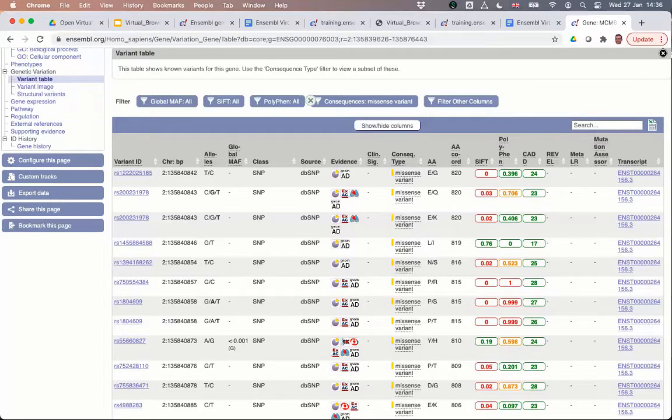There's a question that someone just sent in. Okay, so there's a question here. I think it's from Nathan and also from Nikara about the bolding. So I think this is what you're referring to here. So you've got two rows with these triallelic variants.